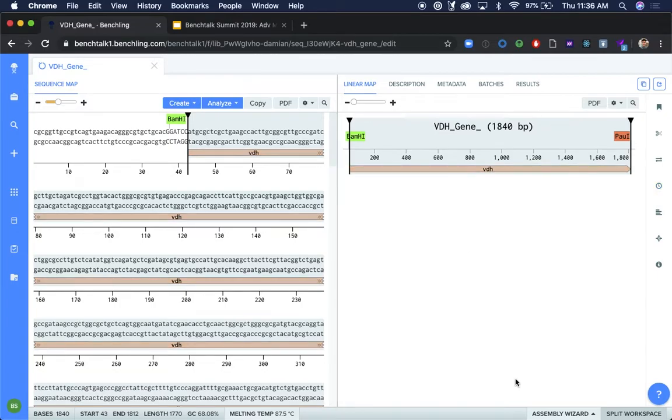So moving right along, the next step for us would be to bulk assemble this particular sequence into a variety of different backbones. Our bulk assembly tool is what we call this combinatorial vector design tool. It allows you to combine a variety of different backbones and promoters and any combination of fragments that you can think of with just a couple simple clicks.